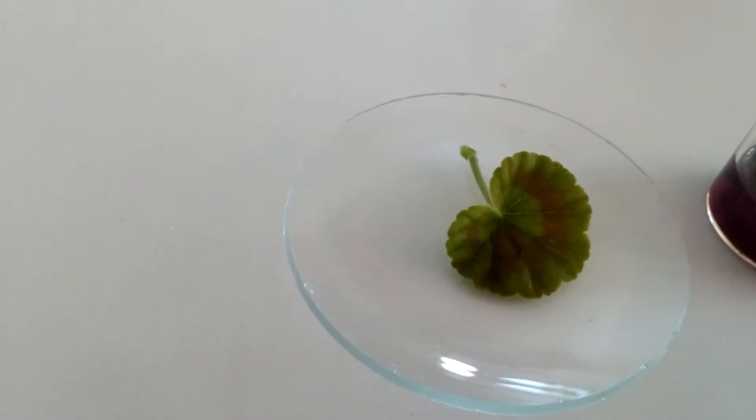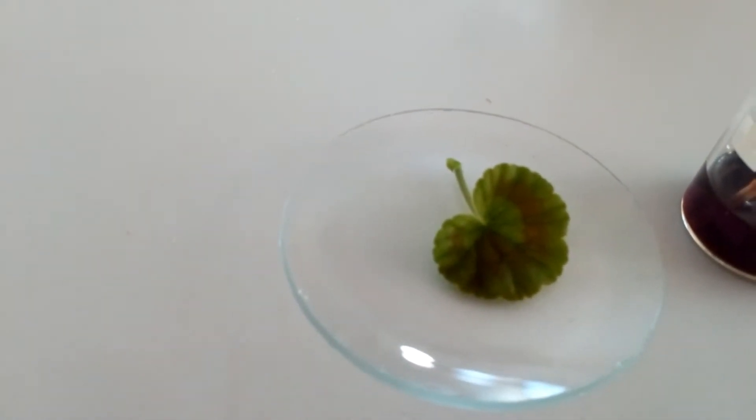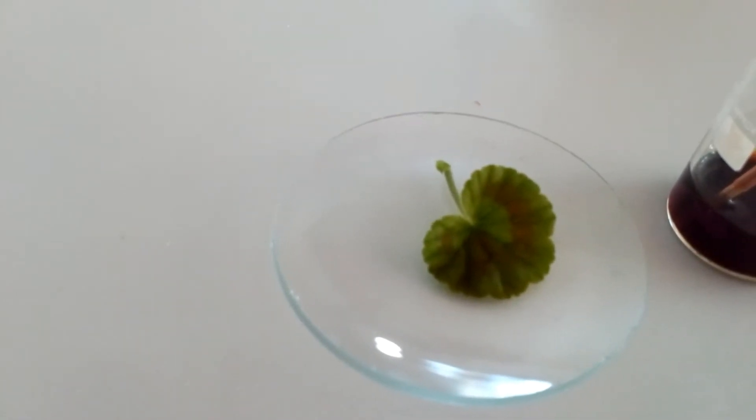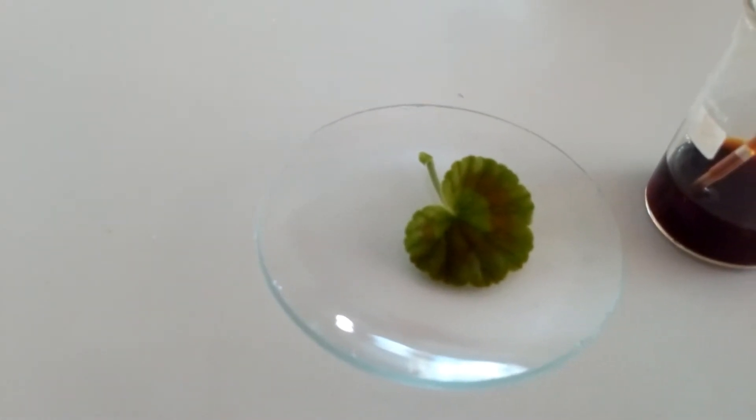So what we need to do is to make the leaf so that it has no green left in it, and we also need to make the cell walls so that they can absorb the iodine solution.